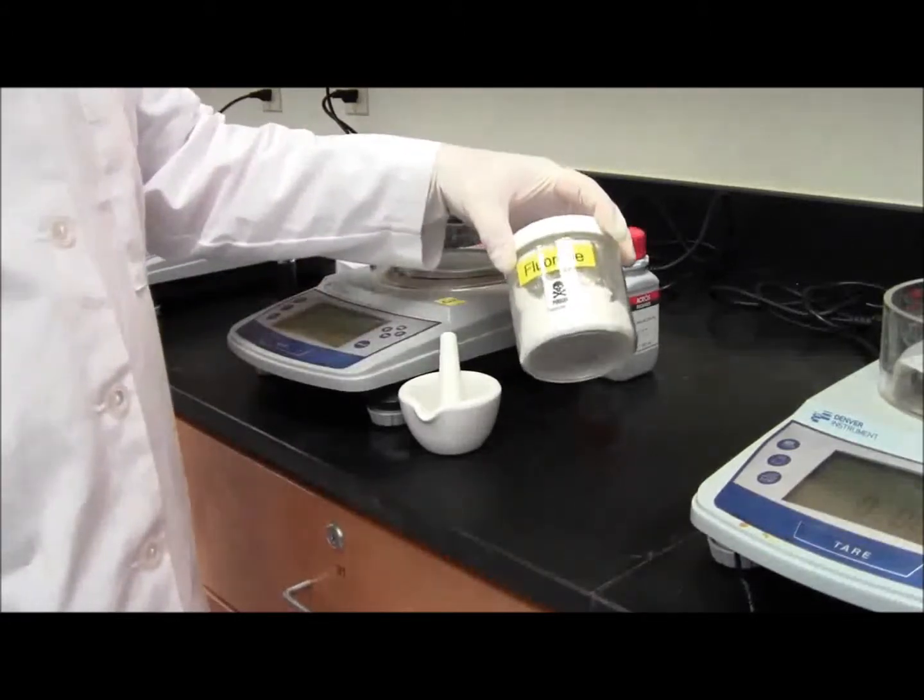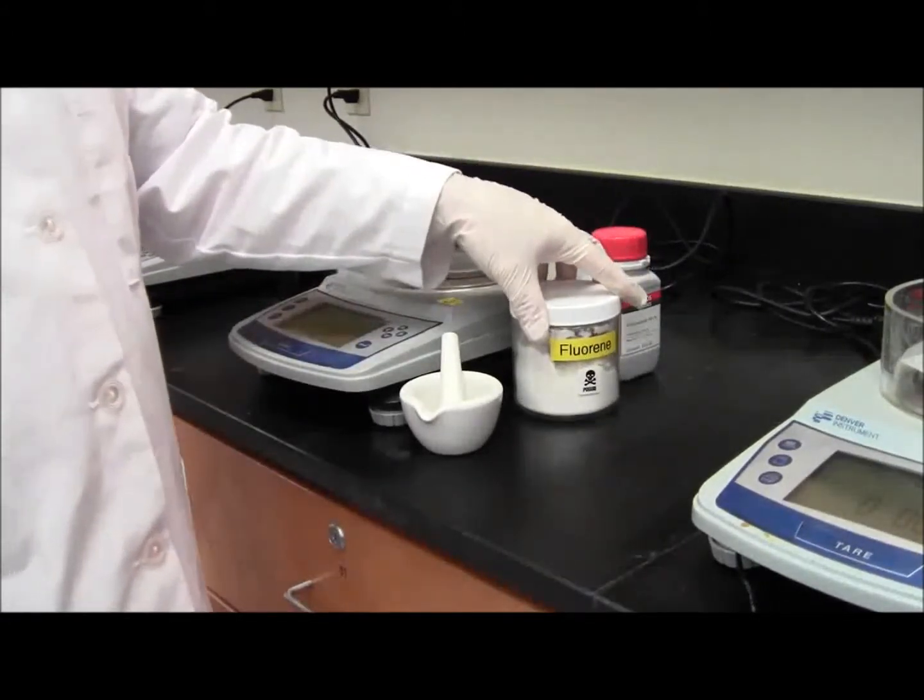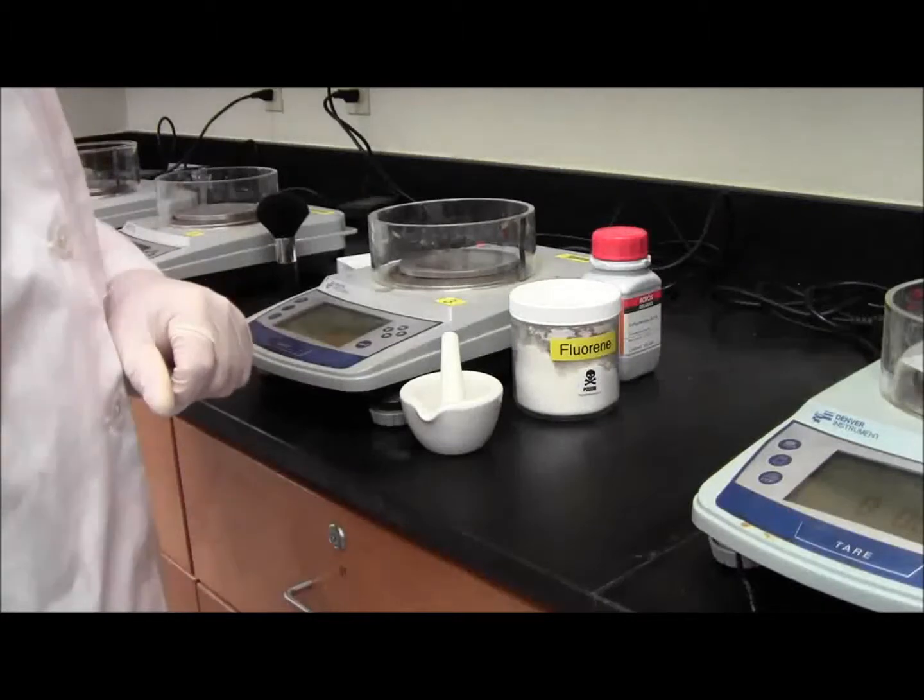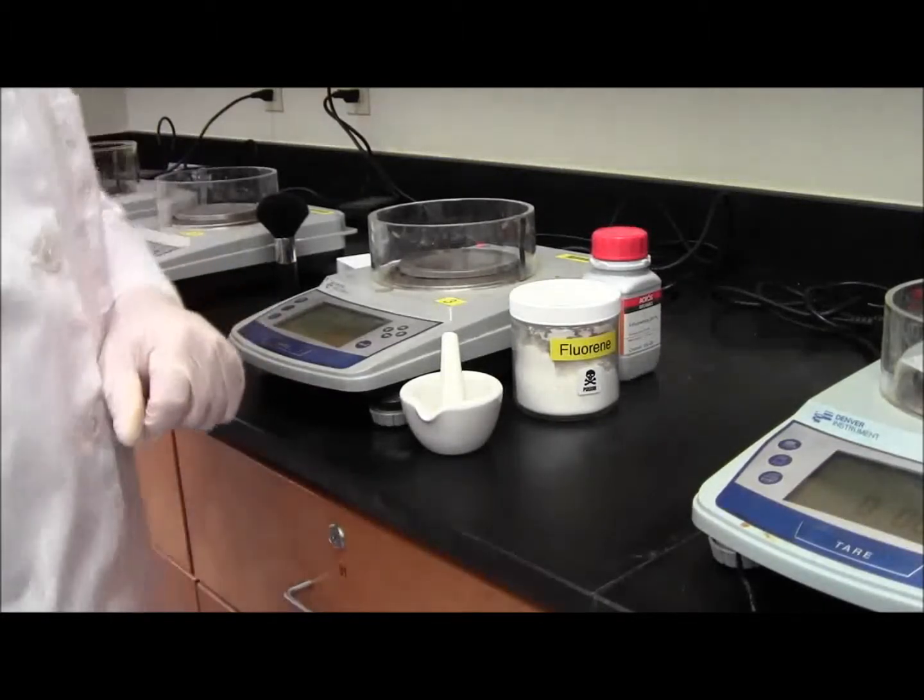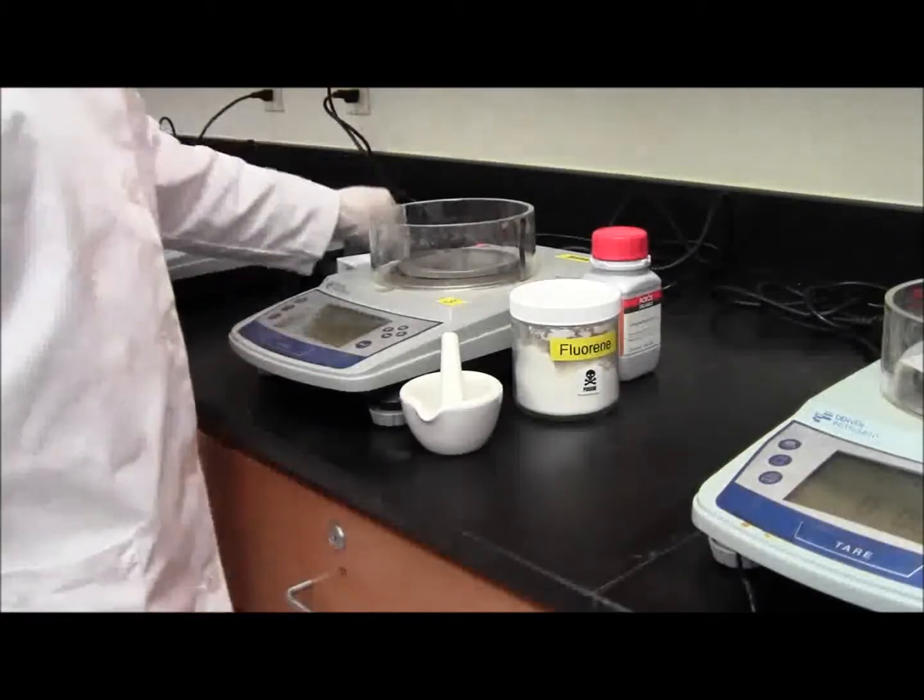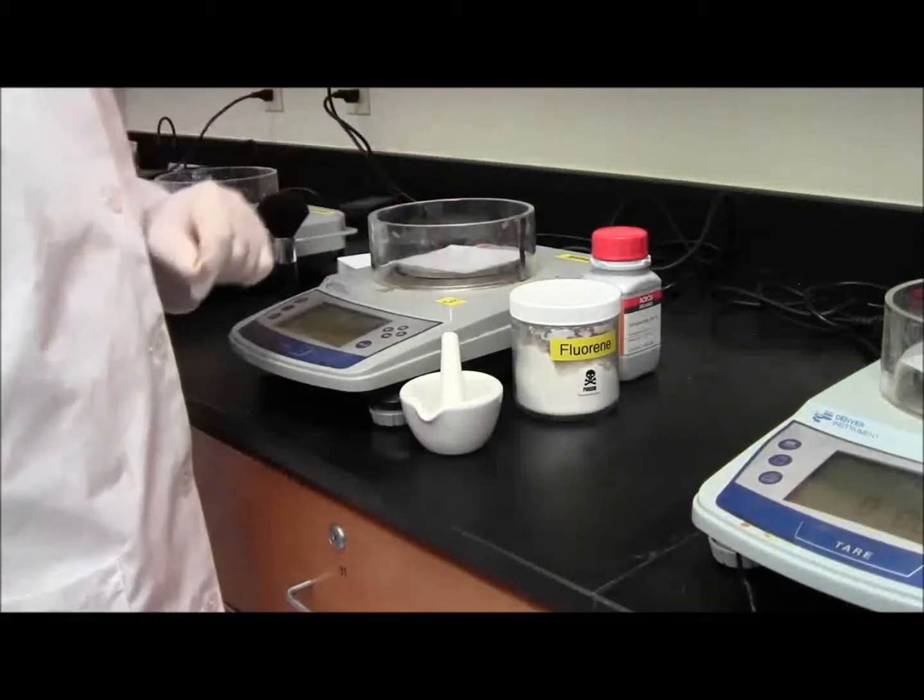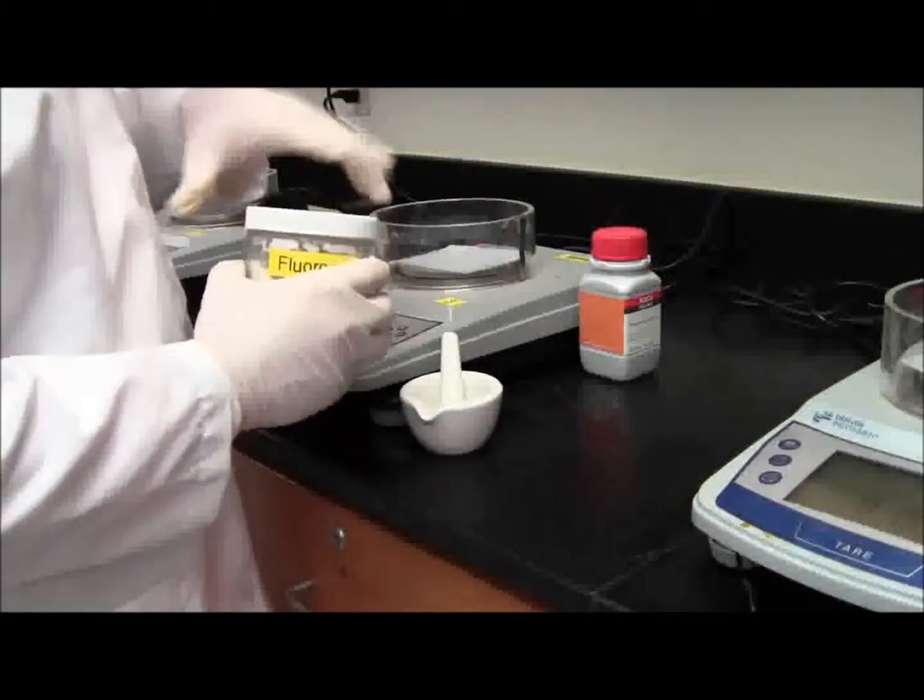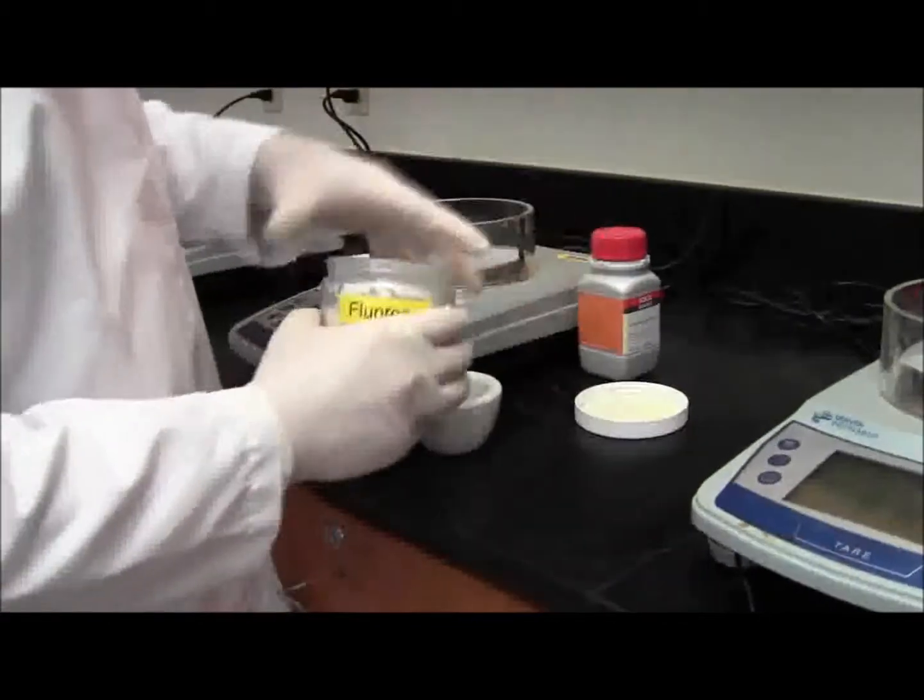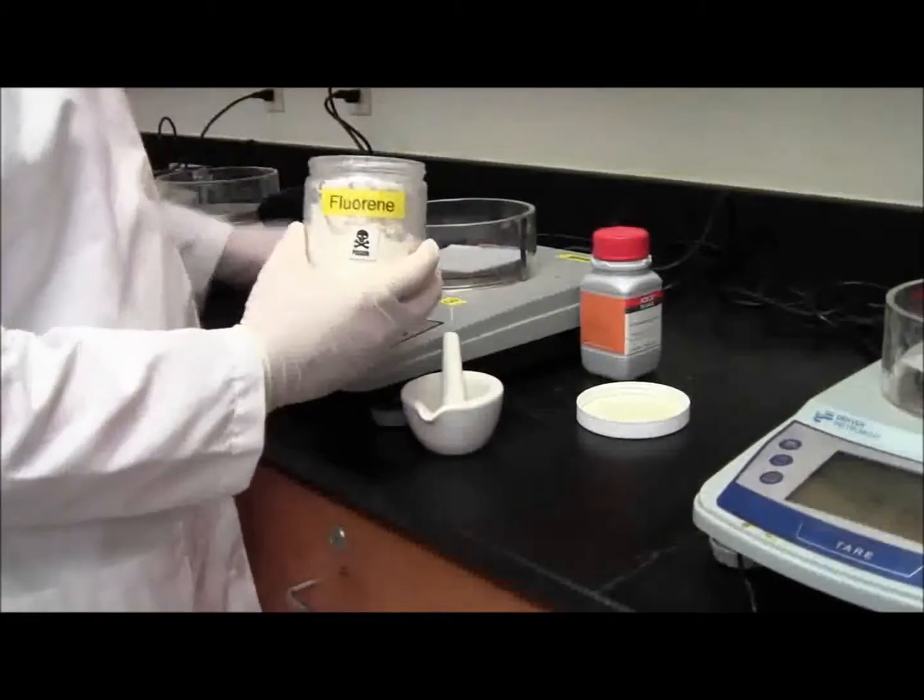The problem with the fluorene is that it clumps up with the moisture in the air. So we'll have to grind it a little bit, so it'll go into solution a little bit easier. Take a piece of weighing paper, tare it, and you're going to want to weigh out about 2 grams of the fluorene.